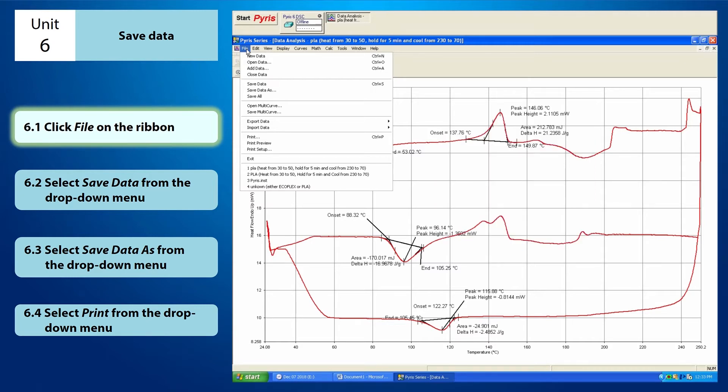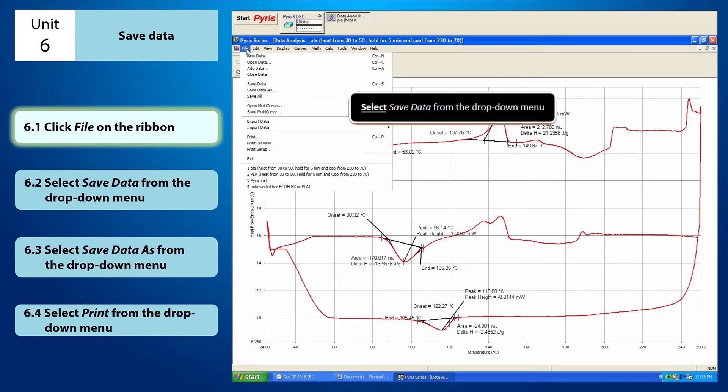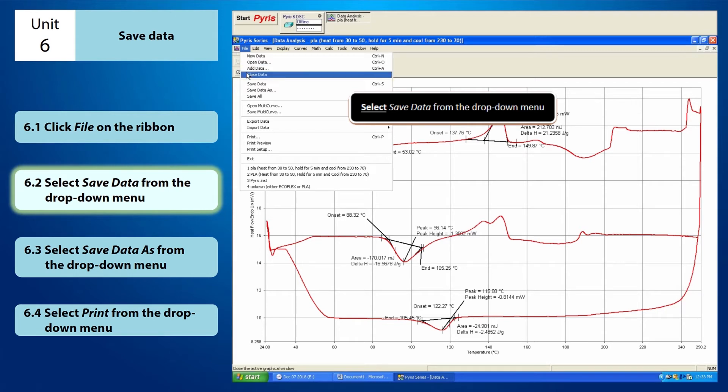If you choose to save the data in D6D format, do you want to rewrite the data file? If your answer is yes, you want to rewrite the data, just select save data from the drop-down menu of file.